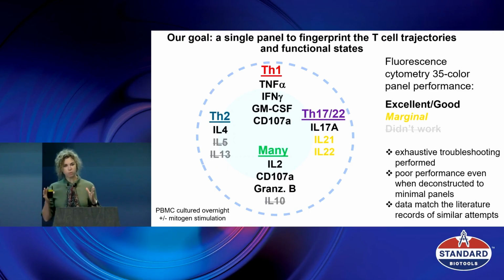So this forms this, let's look under the street lamp mentality where the things that are easy to measure are constantly measured again and again and again, okay? And if you think about PBMCs from healthy donors that we always use for troubleshooting any panels, the Th2 cytokines may be a very small fraction of what we want to measure.